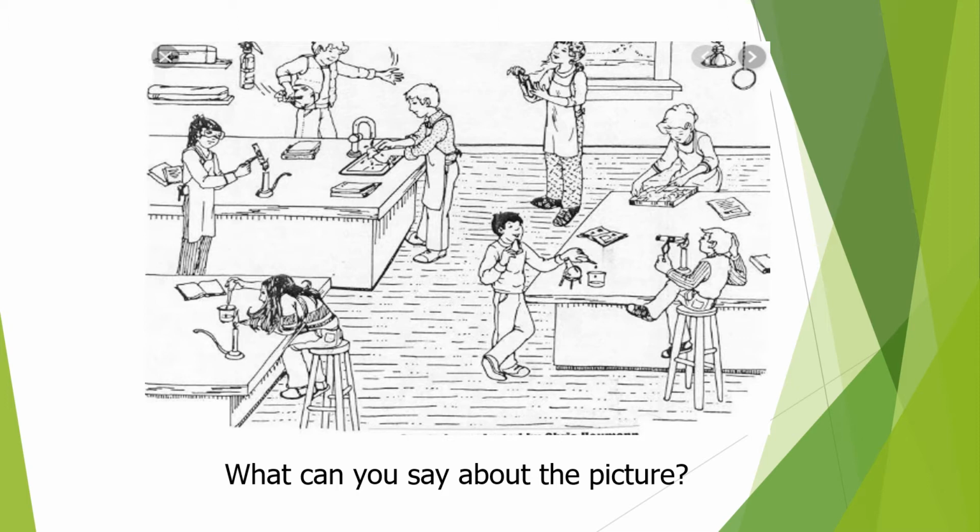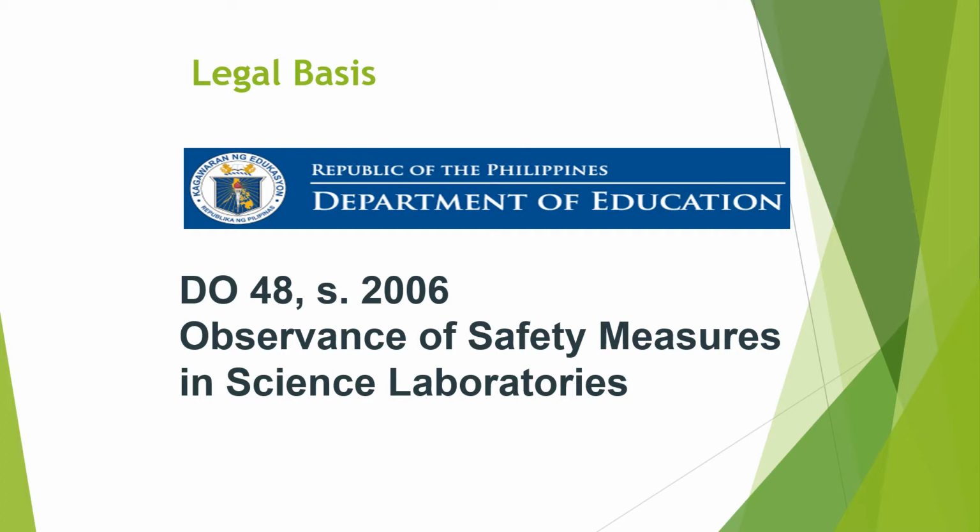There are also some students who follow lab safety guidelines, like some of the students wearing laboratory aprons or safety goggles. In the Philippines, we are given directives from the Department of Education, and it is under Department Order 48, Series 2006, Observance of Safety Measures in Science Laboratories.